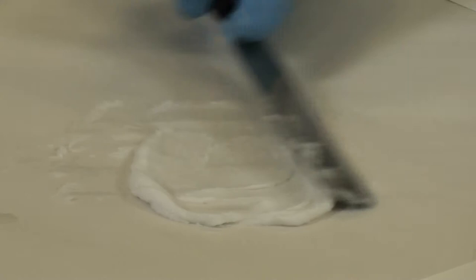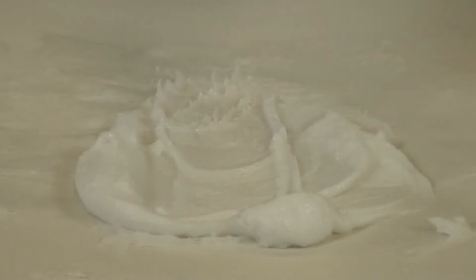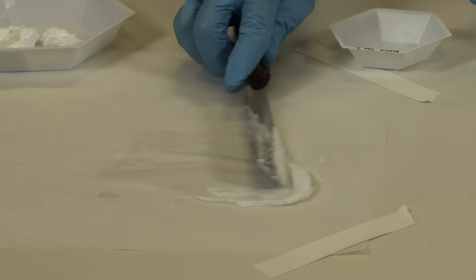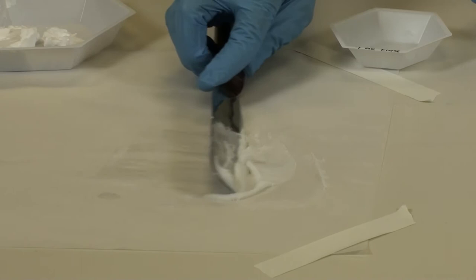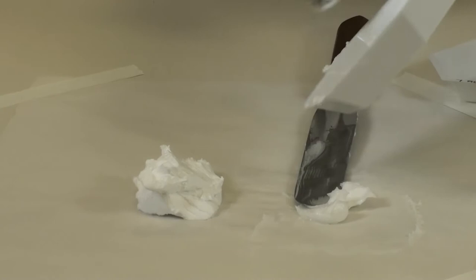Keep moving it back together as the cream starts to try to get away from you on the ointment paper. At this stage, you can incorporate your large spatula to pull that together, and a large spatula will actually spatulate that quicker as well. Okay, once you're satisfied that those are uniformly mixed, go ahead, scrape that back together in a location. And we're going to go ahead and place our aquaphilic near our triamcinolone urea cream.